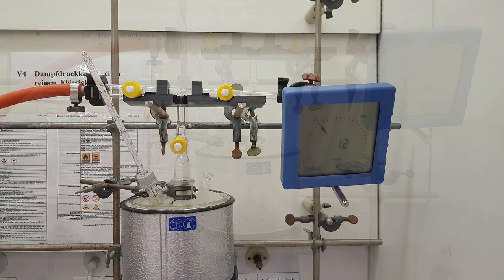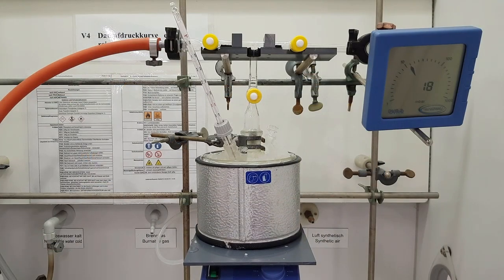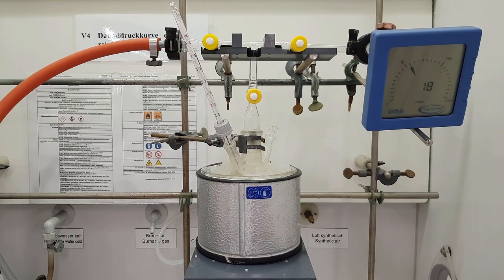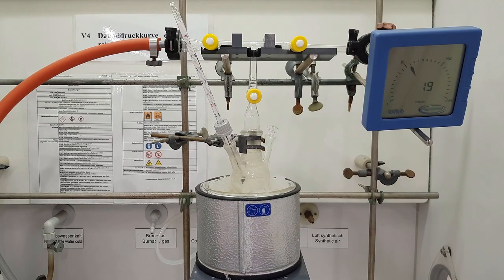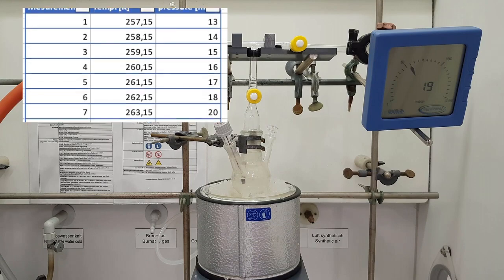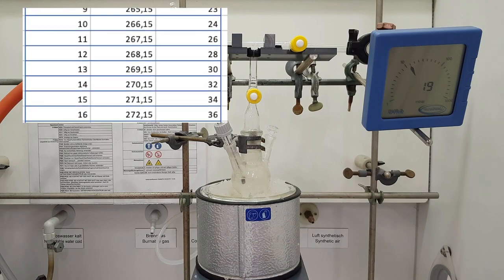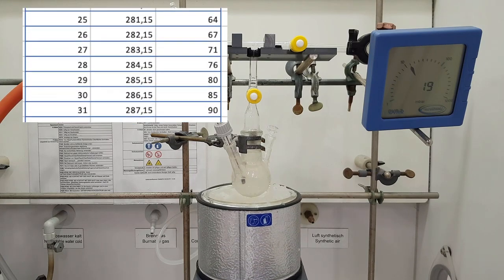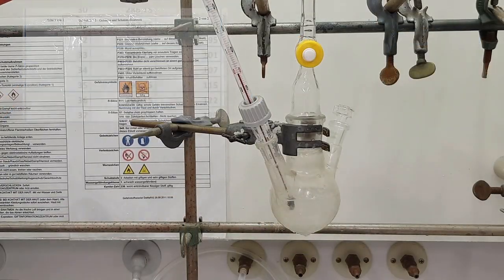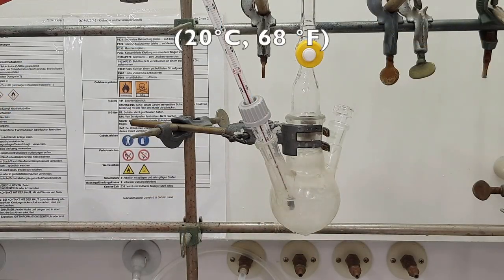The cold bath can now be lowered under the round bottom flask. Both vapor pressure and temperature will slowly increase. Keep note of the values in steps of 1 degree Celsius until the temperature of the liquid has reached 20 degrees Celsius.